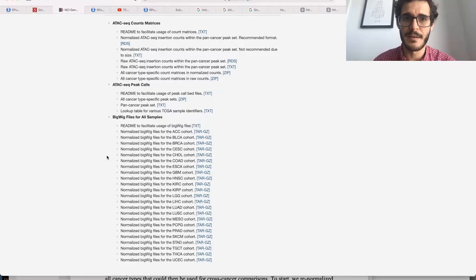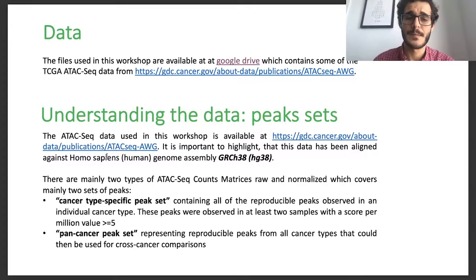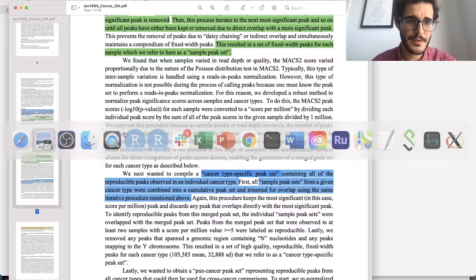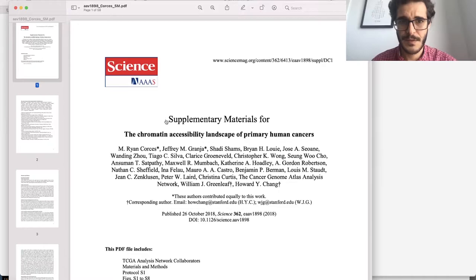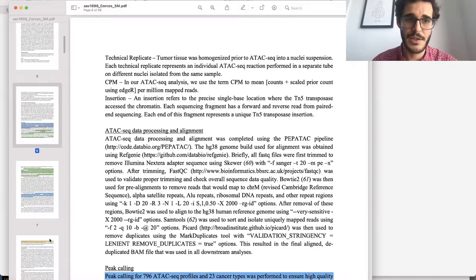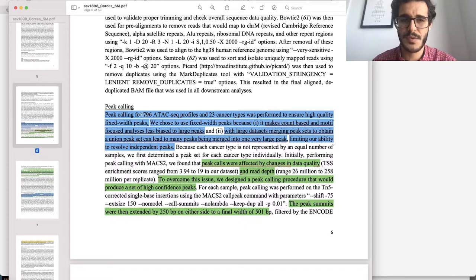These are open ones; you also have private ones available through the main GDC web portal. For understanding the peak sets, you can go into the supplemental material from the science paper — the Chromatin Accessibility Landscape of Primary Human Cancers. That data is described from page six until page eight. They did peak calling for 796 ATAC-seq profiles. We had around 410 samples with almost two replicates each, which is why you have that number for the 23 cancer types.